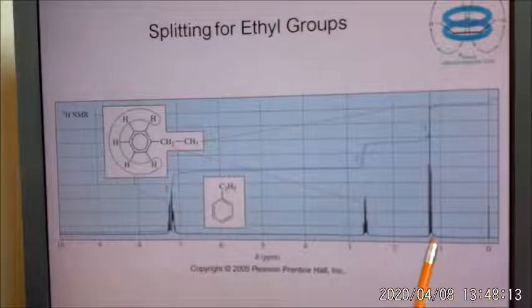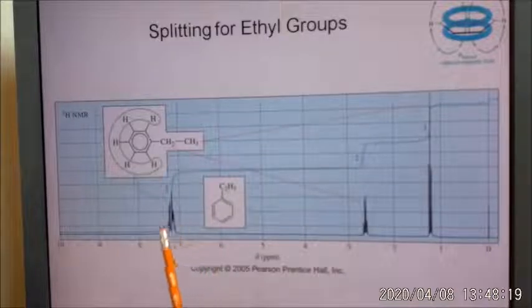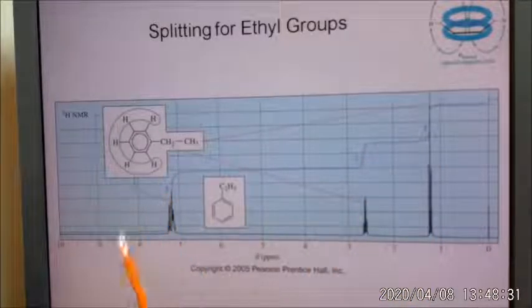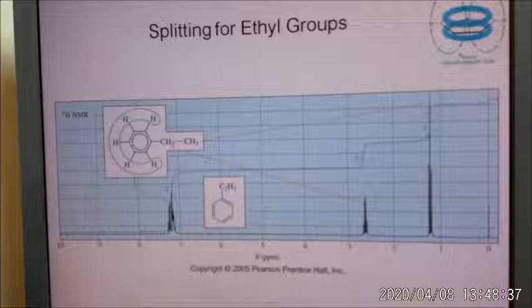So, basically, electronegative, de-shielded. This is your aromatic range. Okay? 7 to 8. That's aromatics. So, you see this? You go, oh, I most likely have an aromatic. We talked about your integration, C5, H5, 5 hydrogens. Okay, that means, oh, it looks like a monosubstituted aromatic.